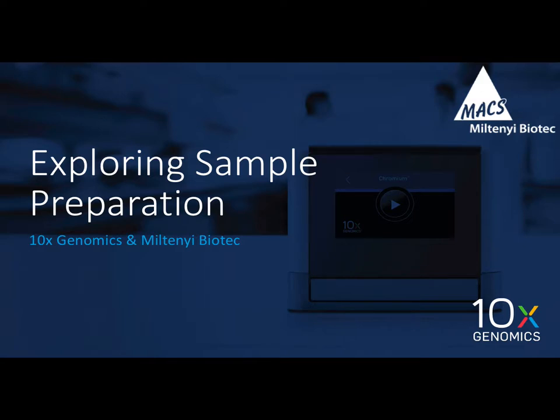Because of that, we are arranging this workshop, and we are very fortunate to have the 10x scientists and also Miltenyi scientists come here to teach us how to prepare the cells and make sure your samples are most optimized for single-cell RNA sequencing, and also other types of data analysis that we might need to run in the future. We booked an hour and a half in this room for the workshop. We will probably take less than that.